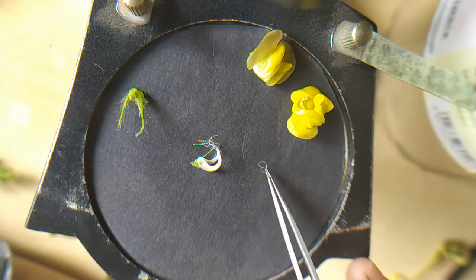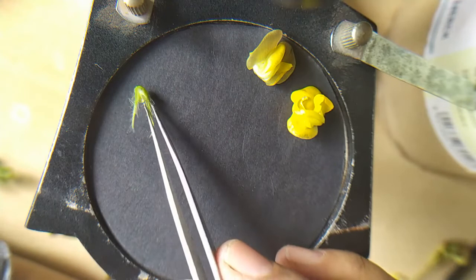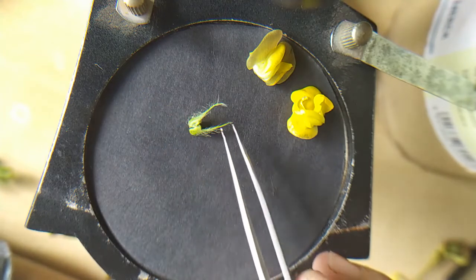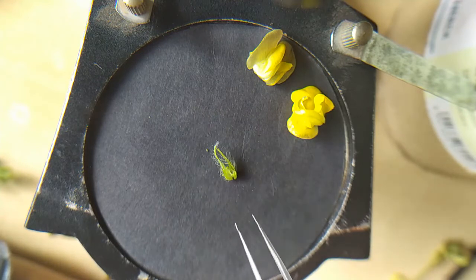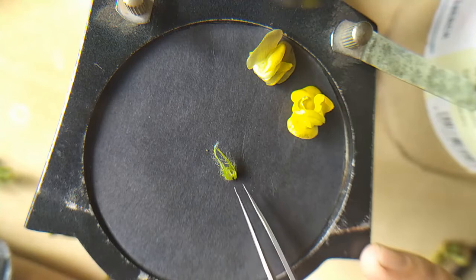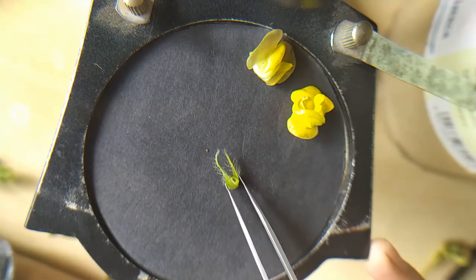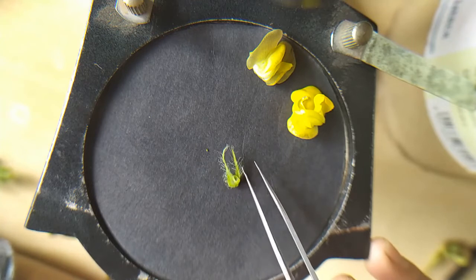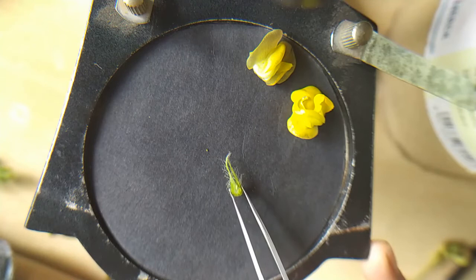Now we start our dissection. How to dissect a flower? Firstly, you have to remove this calyx. The calyx is fused together, so the condition is gamosepalous in case of urad bean and green gram, and pubescence, or hair-like structures, are also present on the calyx. So the calyx is gamosepalous in urad bean.